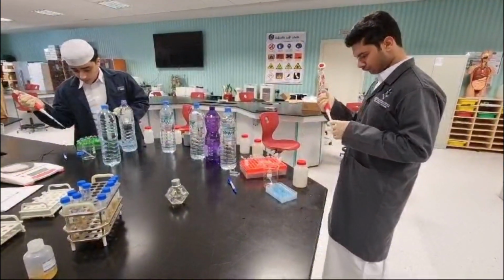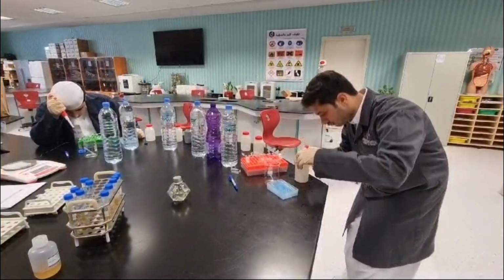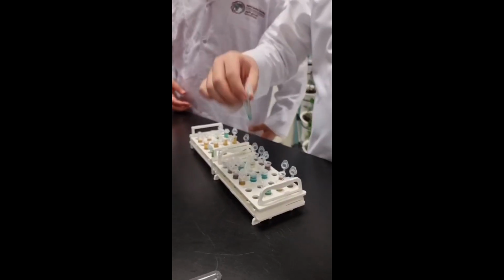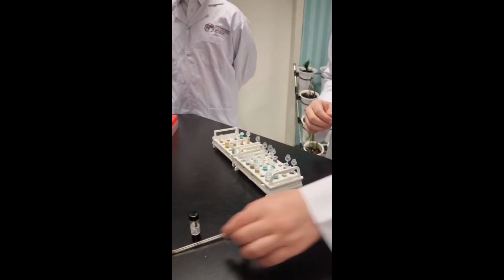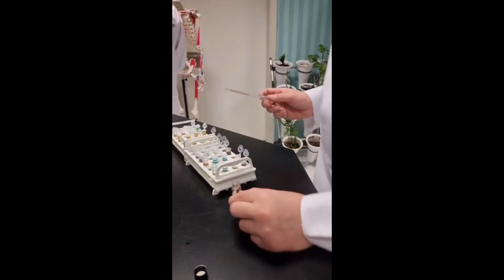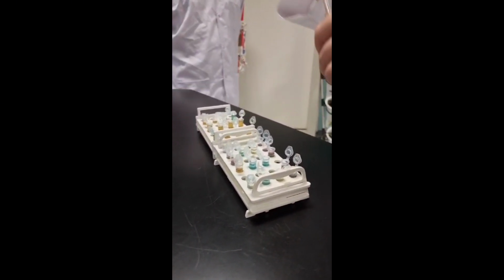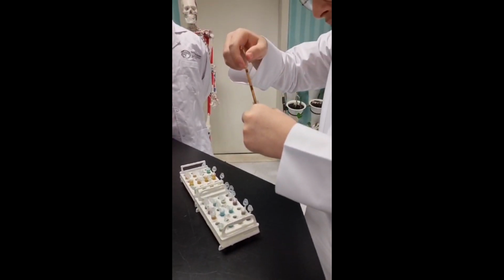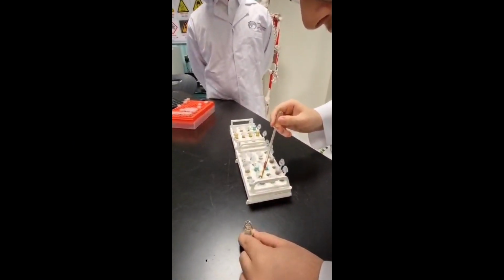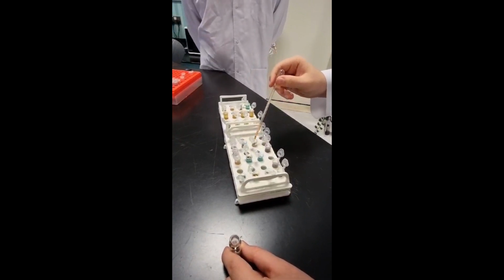Next, prepare the media by adding 5 ml of hot molten media to both the sample and the control dishes. Gently swirl to mix without spillage. Then add covers to allow solidification and incubate the dishes at either room temperature or 37 degrees for 1 to 3 days. Finally, observe the plates and provide answers to the Petrifilm study questions based on your observations. This structured approach ensures systematic analysis within a research time frame.